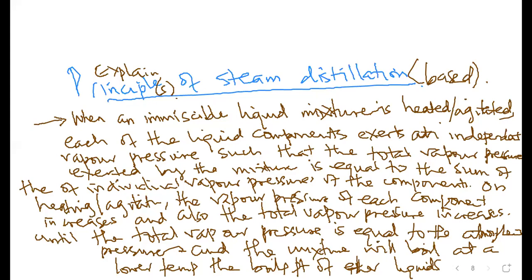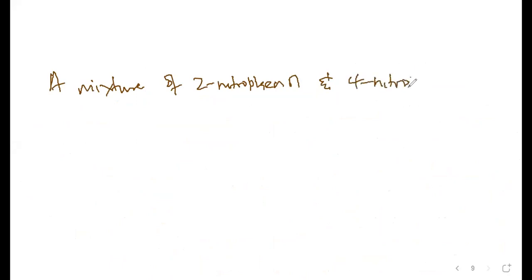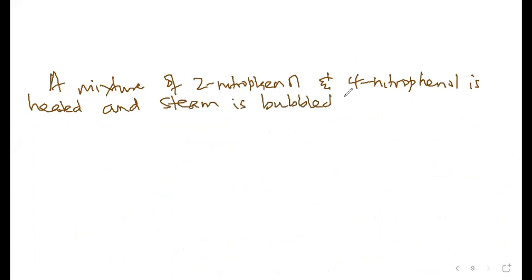We should say a mixture of 2-nitrophenol and 4-nitrophenol is heated, and the steam is bubbled through the heated mixture.